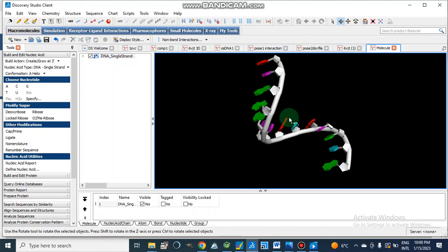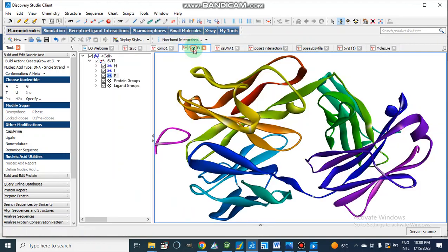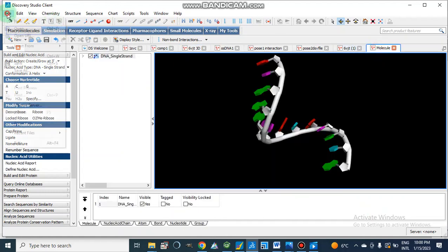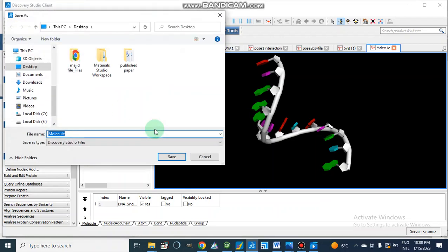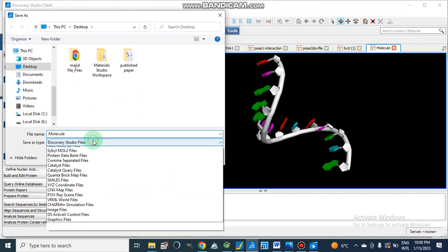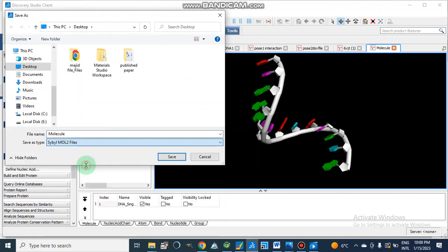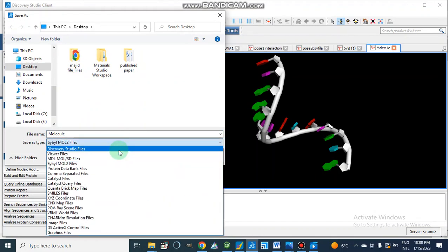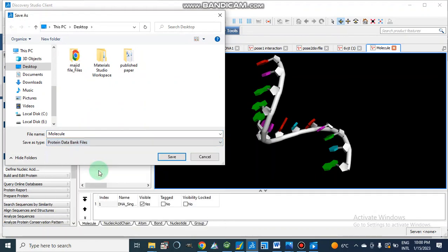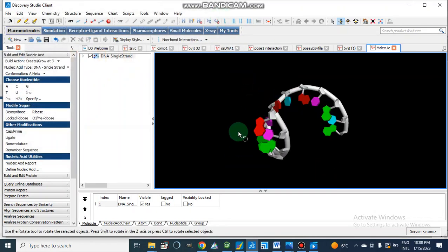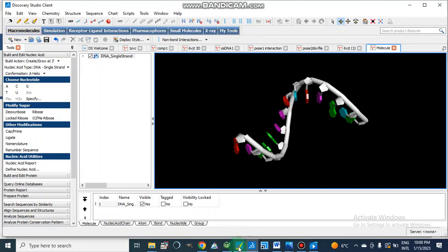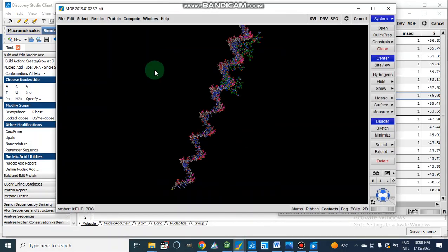So now this is our DNA macromolecule and here is our protein. We will save these files in PDB or MOL2 format. Using Save As, we have the option to save as a Sybyl MOL2 file or as a Protein Data Bank file. We will save these files and then move to MOE for docking.